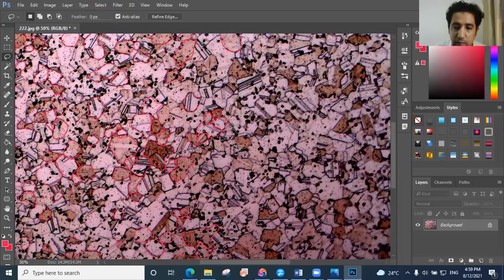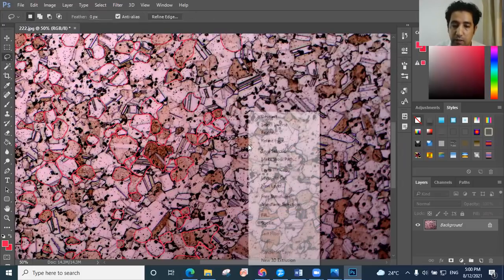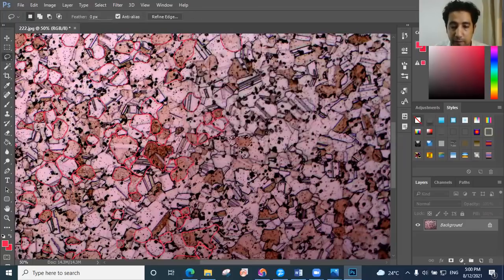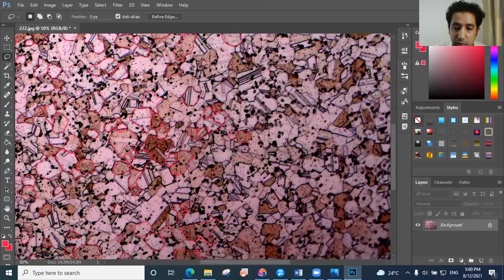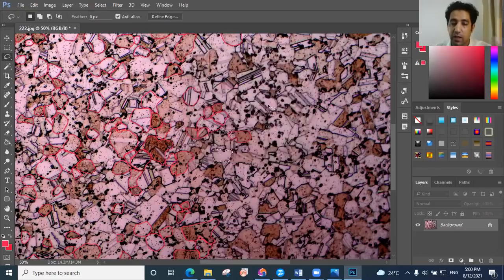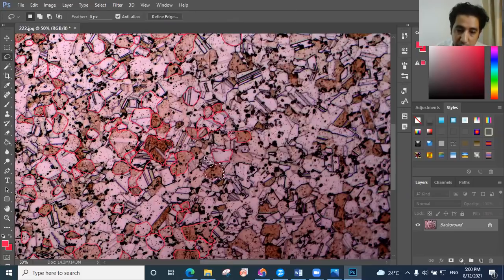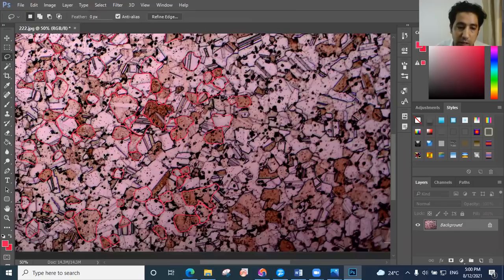You may face some issues when you're calculating. See, this is where we're going to click, then click again. You may face some issues and problems when you are calculating, so just keep watching. Now I made some mistake, then I go back and do it again. If you face any mistake, you will find it here in the video if you watch until the end, because I'm gonna face some problems too when I'm doing this calculation. And I will fix it in this video, then you will not have any problem.